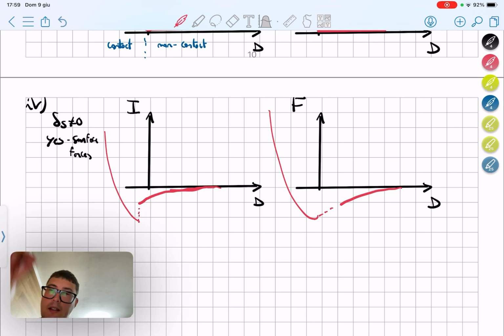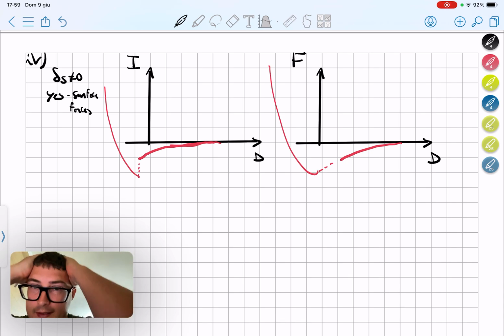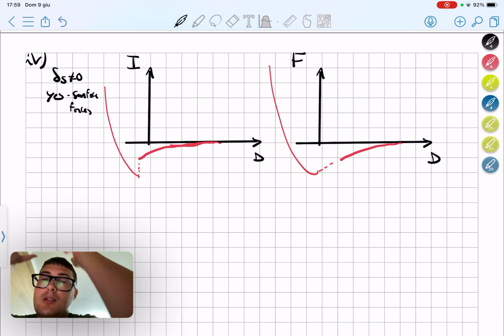So essentially, we have reached a position in which the gradient of the attractive forces exceeds, as we said, the spring coefficient of the cantilever, and the tip is jumping into the sample itself. As it jumps, it penetrates inside. So whatever we can think about contact is somehow like a mess, okay?